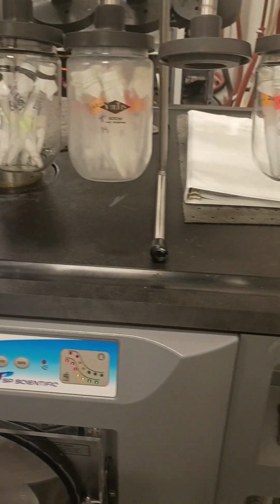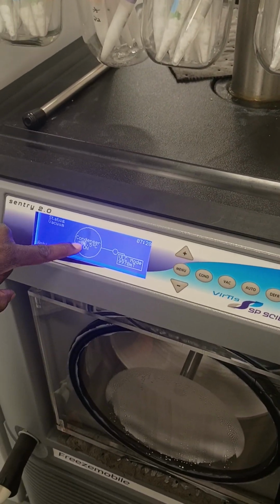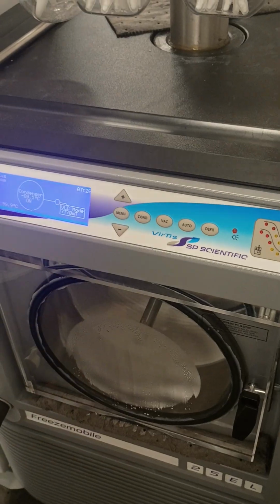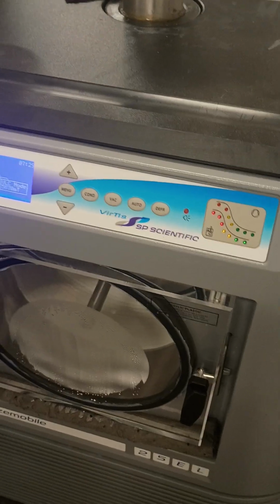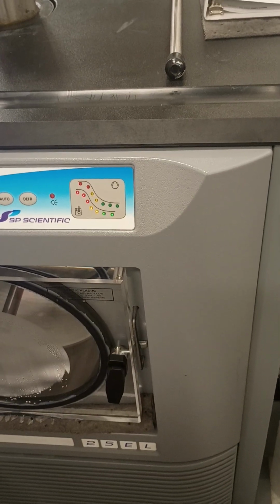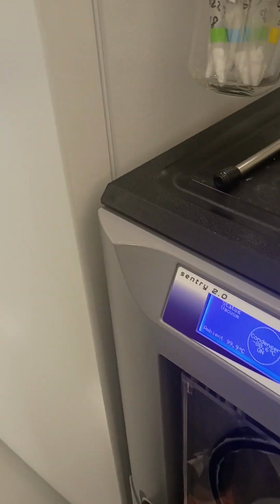The program is already set. The vacuum is already running. The condenser is the one that chills everything. You don't have to touch anything here unless there's a power outage or whatever, then you can come and reset. We'll show you how to do that with the power outage. But at night, just make sure everything is sealed, because sometimes people leave it open with nothing in there, and everything's going to melt.